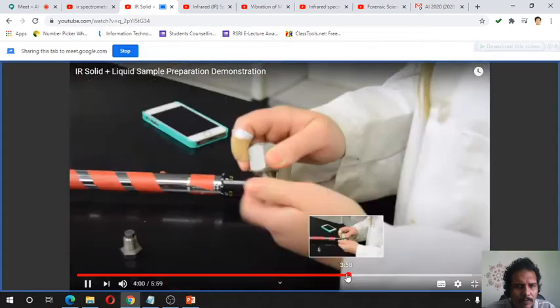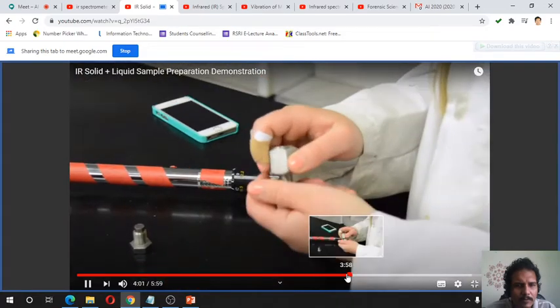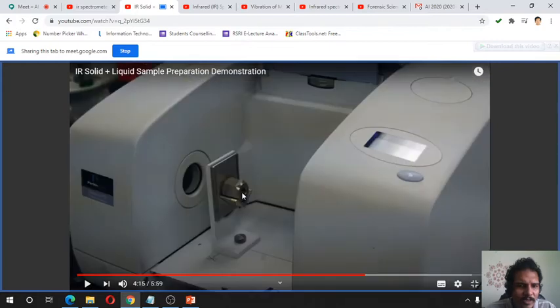Okay. Tap the sides of the bolt on the lab bench to remove loose particles. Then turn to the IR and make sure the background scan has been run without the bolt.